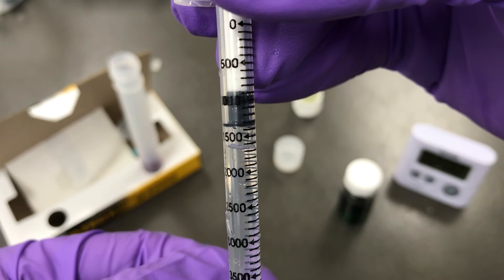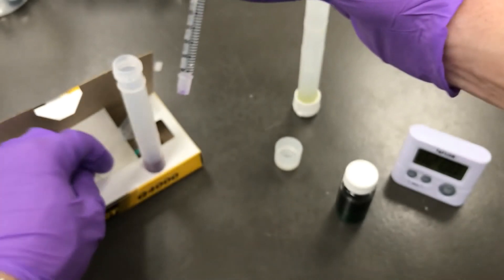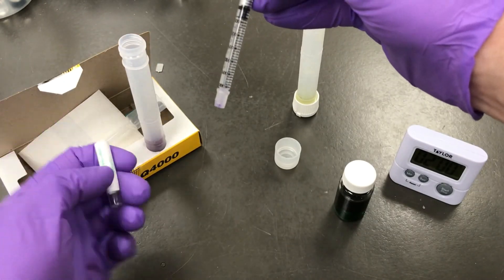Now you can unscrew the titration burette and read the results right off the side of the burette. You want to read the results from the bottom of the black plunger. You can see that this particular test is about 1400 parts per million.